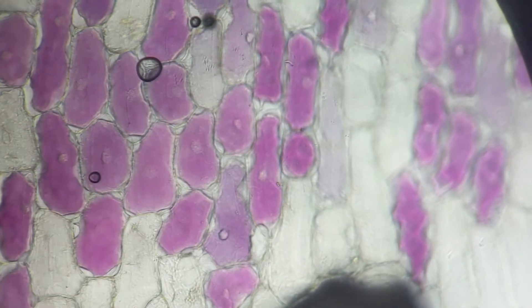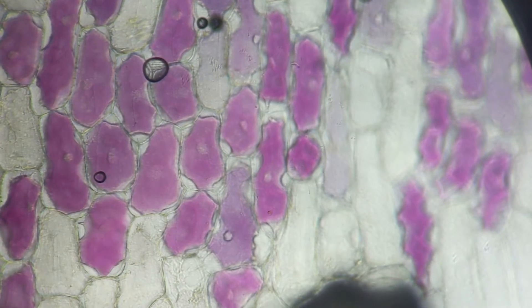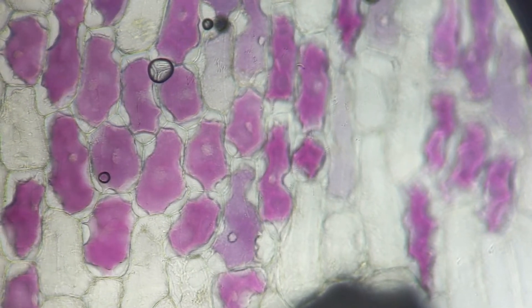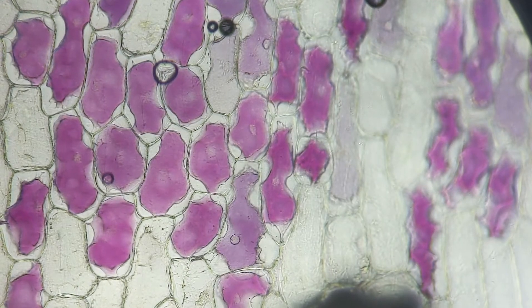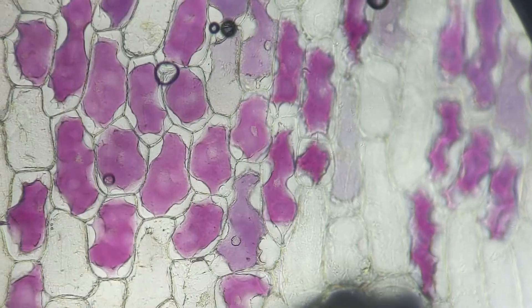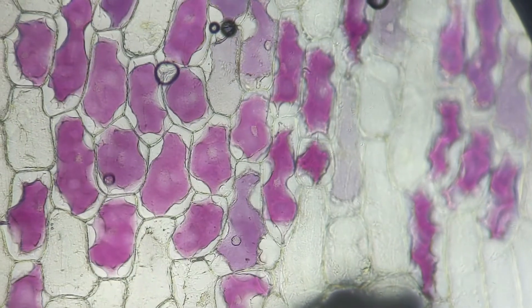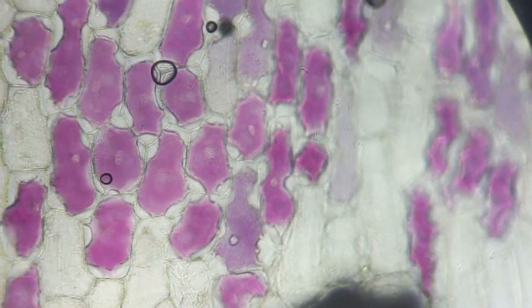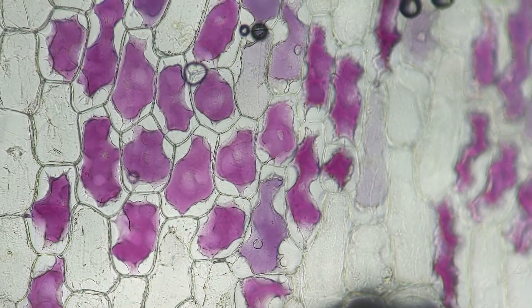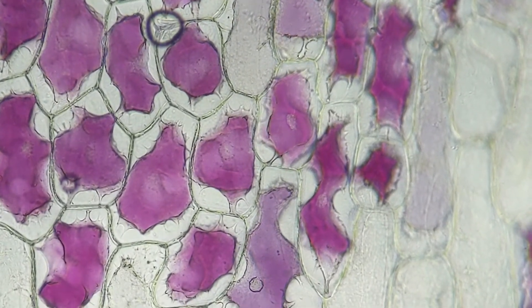You can see that where the cells were originally hypertonic and the pure water was hypotonic, the tables have turned. Now the cells are hypotonic to a hypertonic salt brine. So as water flows from high concentration to low concentration, water is going to evacuate out of the cells and into the environment — the cells are going to shrink. You can see in this sped-up version, on repeat, that the cells are losing water to their environment and shriveling up. That salt brine has allowed us to really see the texture, shape, and overall nature of a cell membrane compared and contrasted to a cell wall.